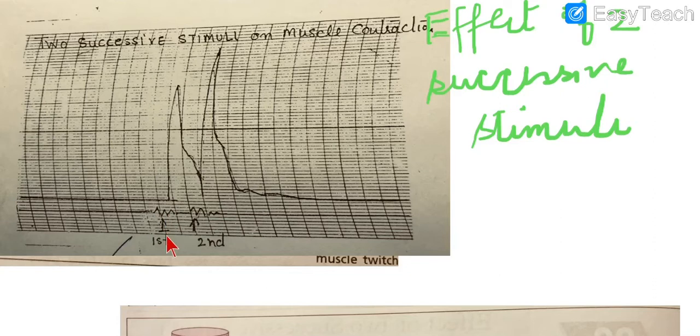This is the first stimulus and this is the second stimulus, and the upper line is the effect we are getting. The effect is the contraction and the relaxation phase, right? So actually this is the simple muscle twitch. Why are we getting the simple muscle twitch this way? Because we have reduced the speed of the drum, so that we can easily appreciate the effect.